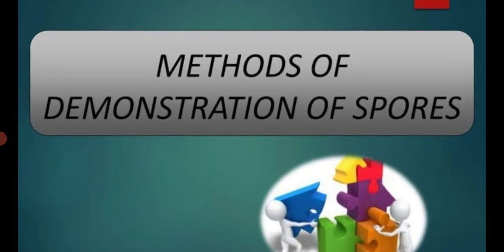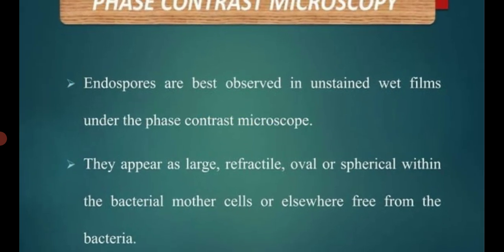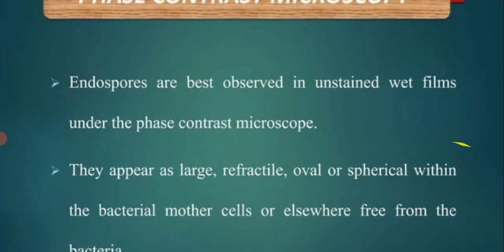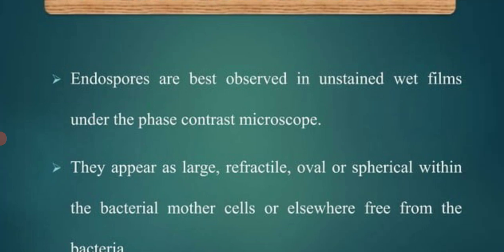Then the methods of demonstration of spores. Spores can be observed under phase contrast microscopy. In phase contrast microscopy, endospores are observed in unstained wet films.